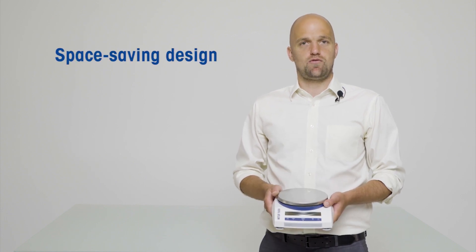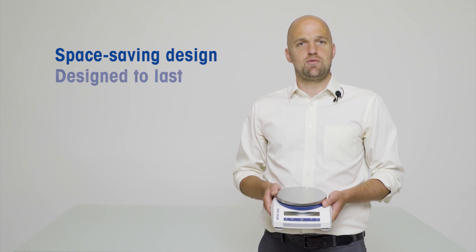Hello and welcome. In this video I would like to give you a quick product demonstration of our PLE Portable Laboratory Balance line. These portable balances feature high quality construction and solid performance to ensure consistent and reliable weighing results.